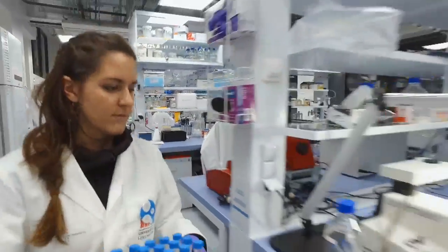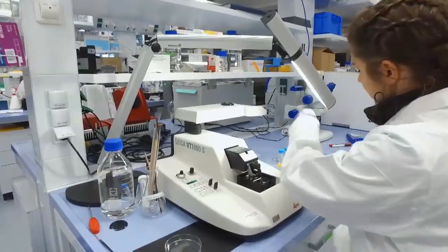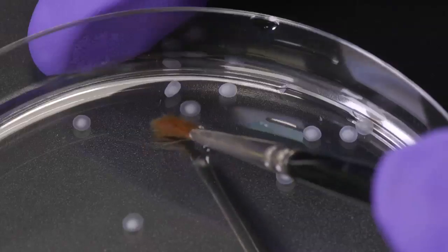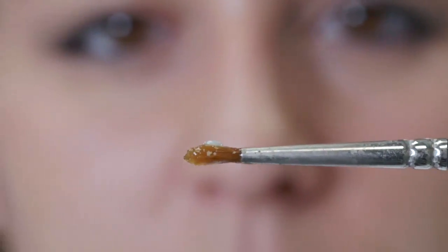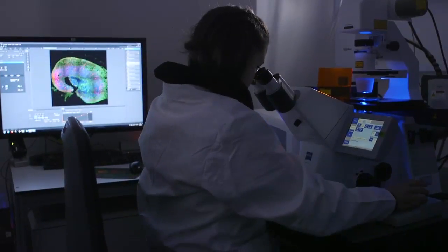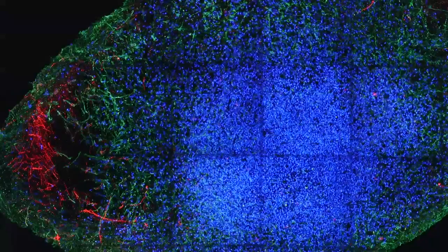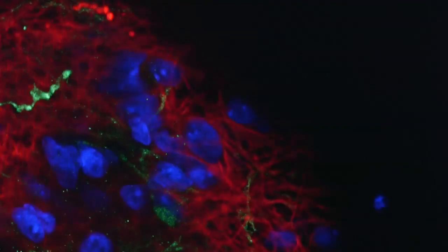The researchers, however, also want to better understand the complex processes in the brain that lead to the onset of the disease. In a special culture, they allow patient stem cells to grow into three-dimensional neural structures that resemble little brains, which are therefore referred to as mini-brains. Under a fluorescence microscope, the areas within it that are affected by the diseases can be targetedly visualized. This way, the researchers can investigate how the changes typical of the disease arise in the brain.